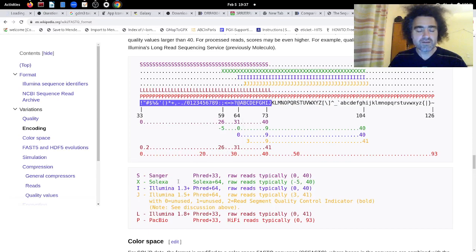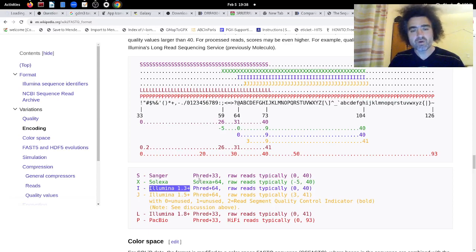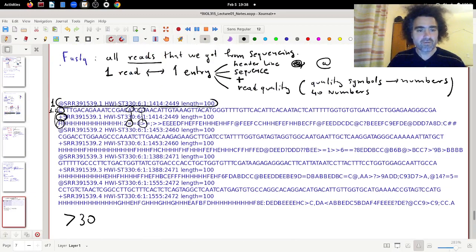Something else that we can notice here is that different technologies, or even different versions of Illumina, or other companies, have different quality score representations for the reading. The software that we will use for downstream analysis can actually understand what the encoding is, and can judge if it wants to use a low quality read or just exclude it from further analysis. For example, a software might choose, or we may choose, by applying the proper filters in a software, to exclude reads that are of low quality.